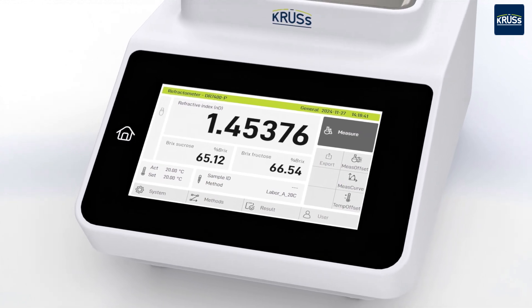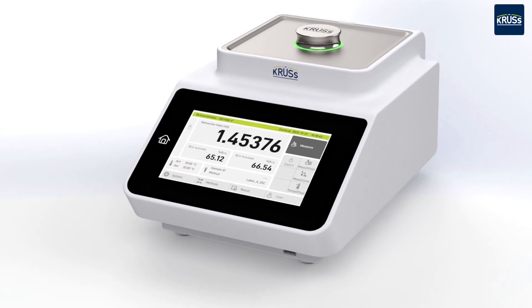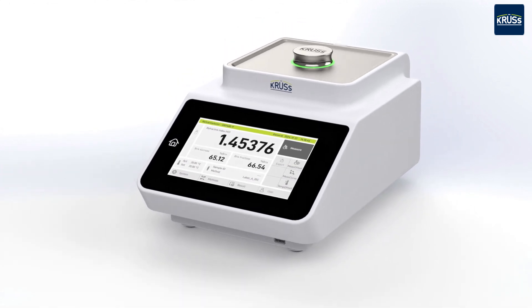The DR7000 refractometers are therefore the best choice for modern, highly efficient quality control of almost all liquids and pastes.